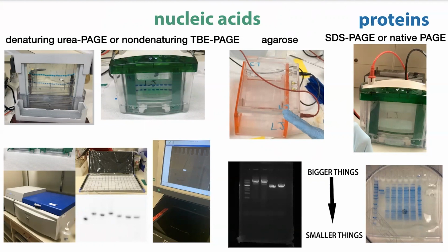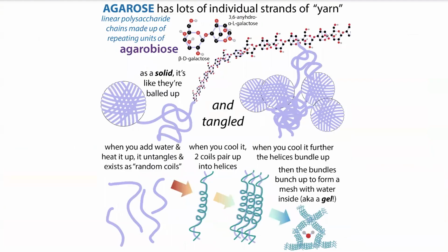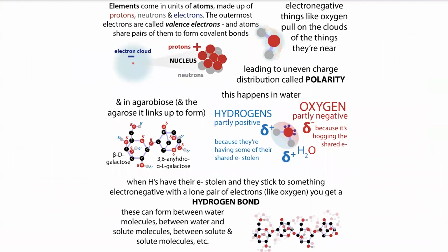What's really cool about these gels, or one of the things that's cool about them, is that unlike with polyacrylamide gels, so things like if you're running an SDS-PAGE to separate proteins by size, or you're running a TBE-urea PAGE to separate small RNA molecules, those gels are going to be chemically cross-linked. So you actually have permanent interactions, permanent links between the chains, and so they're non-reversible. But in the case of our agar and our agarose gels, our chains are more kind of just like a knit scarf. The chains are going to be held together by attractions, not permanent bonds.